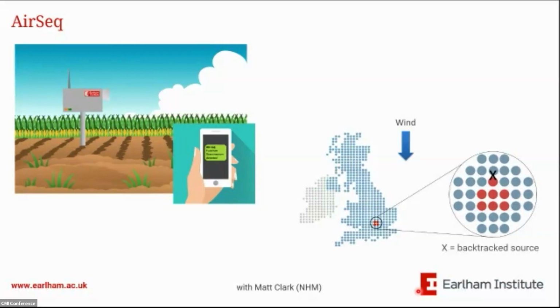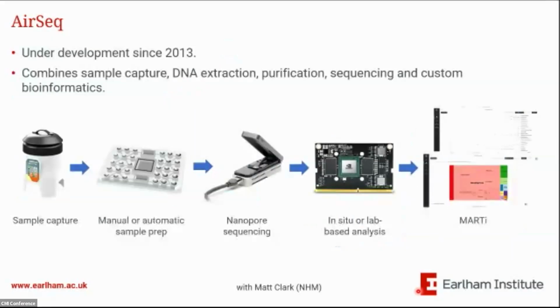more targeted treatments of pathogens in agricultural environments, and to be able to alert to the presence of emergent pathogens. So our vision ultimately was for a box that could sit in a field monitoring the air and alerting farmers or agronomists as pathogens reach threshold levels or new pathogens emerge. And then ultimately, the dream would be to have a network of these sensors around the country.